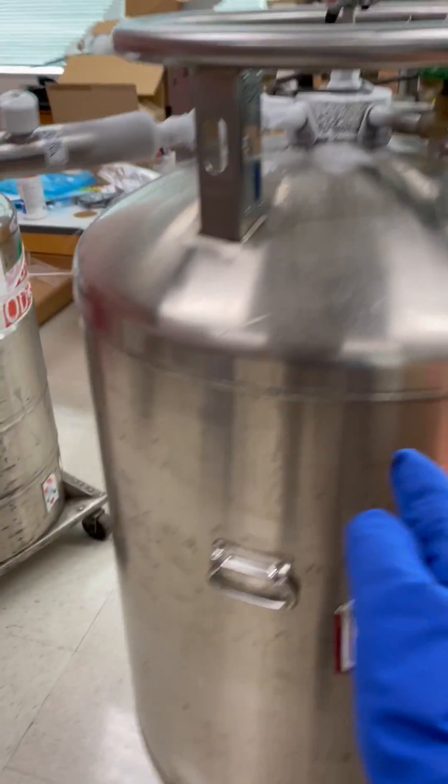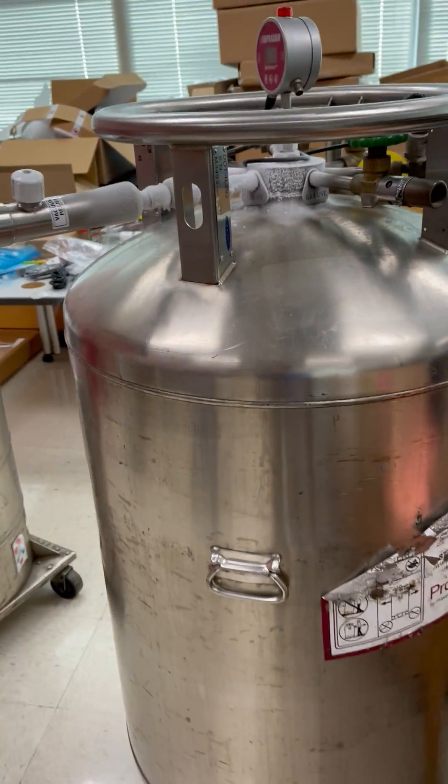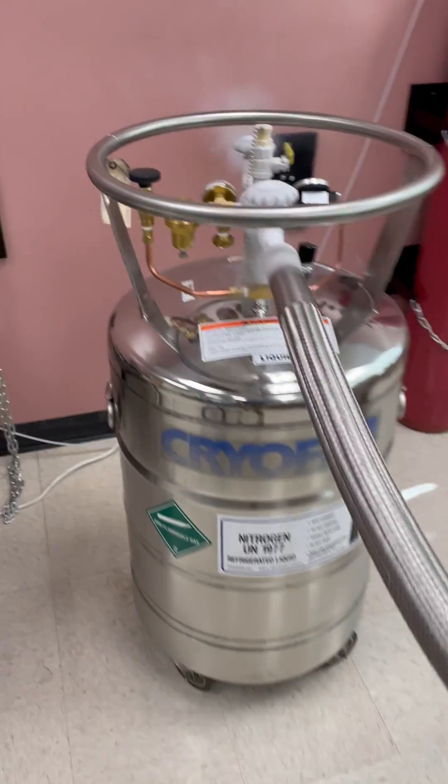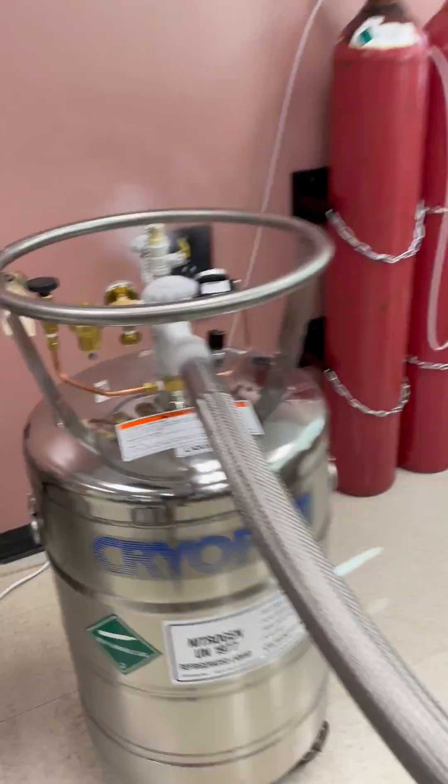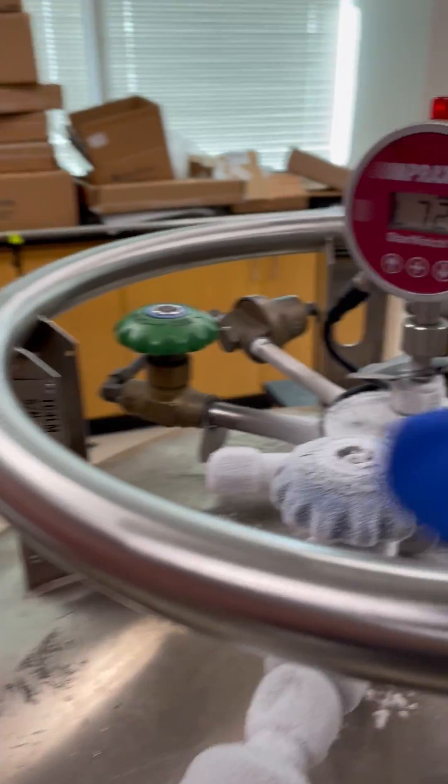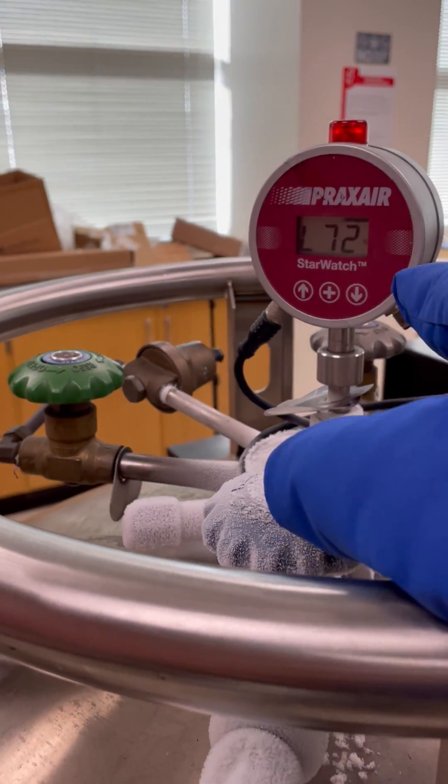This video shows you how to do the liquid nitrogen transfer from the tank, which is 240 liters, to our Dewar, which is 80 liters. So we expect that the percentage should drop from 100 to about 66. I've wasted some of them before.